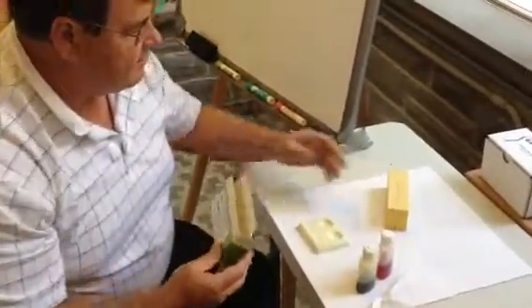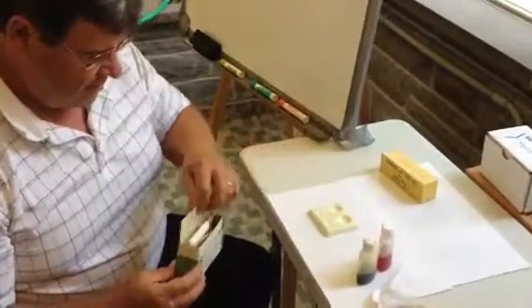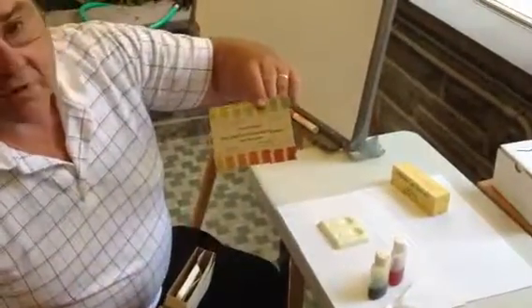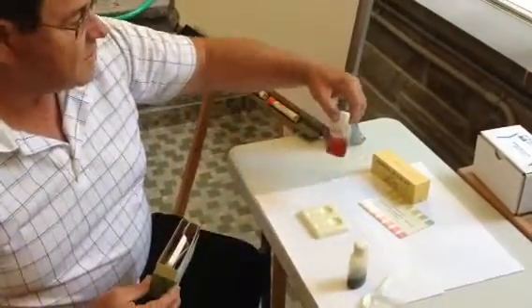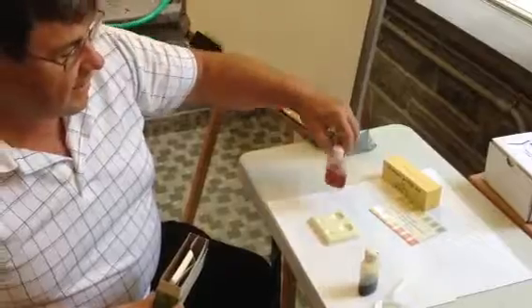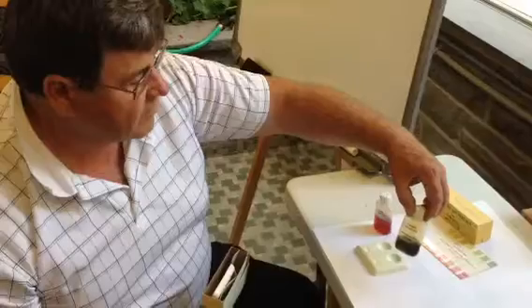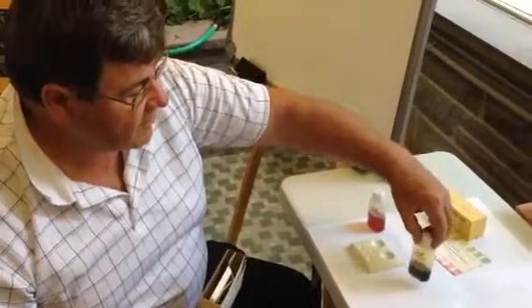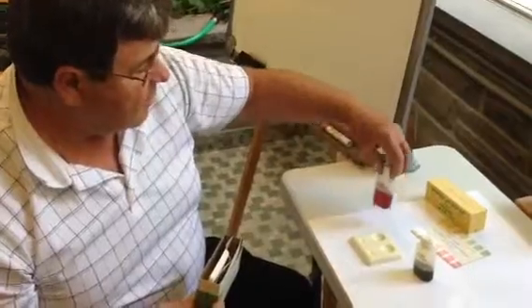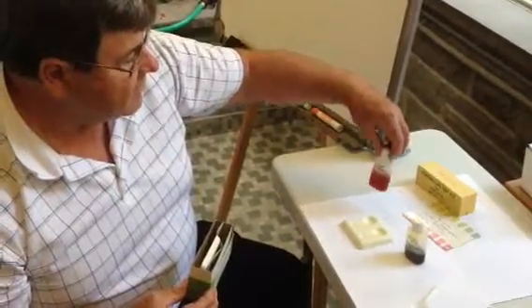Basically, inside the pH test kit, there is a vial for you to work with, there is a chart for you to compare the color, and there are two chemical reagents: Chlorophenol Red and Bromothymol Blue. Bromothymol Blue is used for testing the more neutral soil from 6 to 7.2, and Chlorophenol Red is for the lower pH soil from 5 to 6.2.